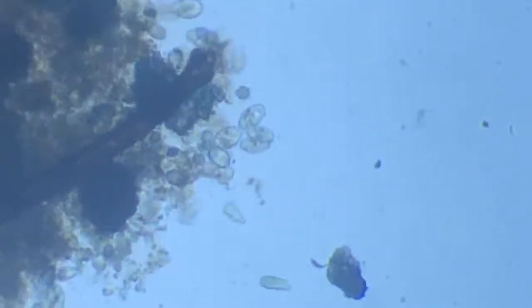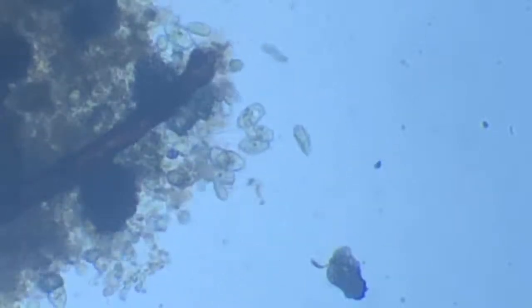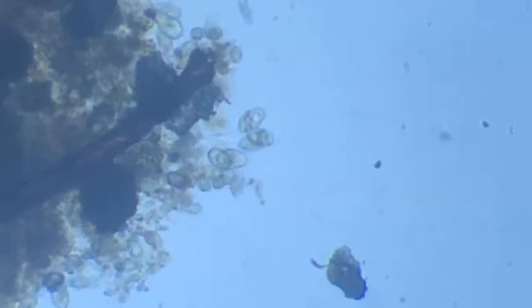This movement of vorticella, the sudden recoiling, it's one of the fastest of movements. Now imagine such a small animal, a single-celled animal, doing such high strength work. This is fascinating, right? Got to give them full marks for this.